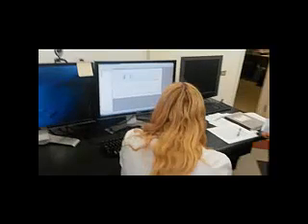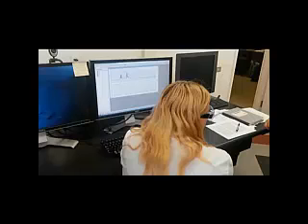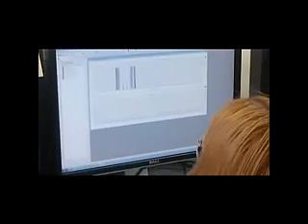Another thing: when you open up these graphs from the open menu, it opens them so that you can't do anything about it. You can't move it around. You have to click this little pin right here, the push pin, to put it on there, in order to search for your sample.